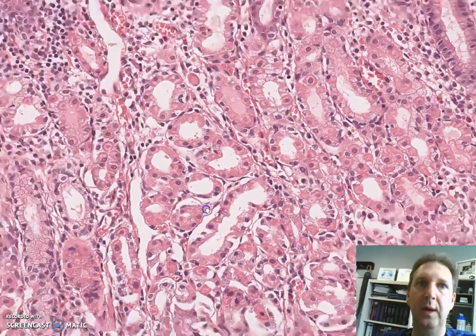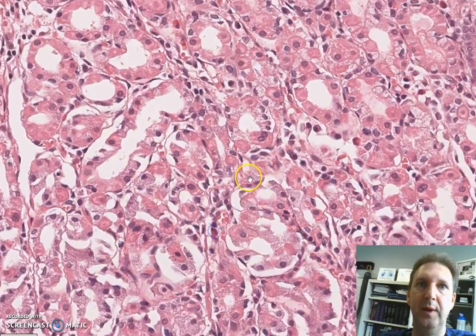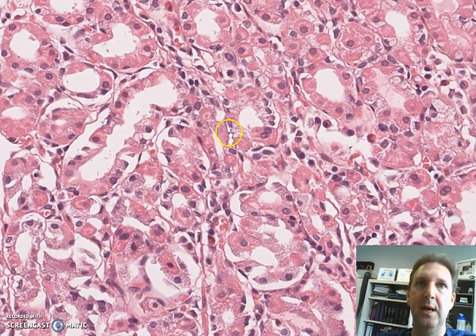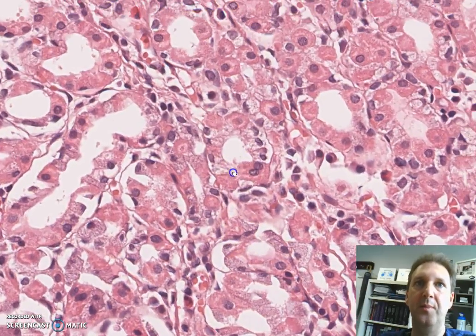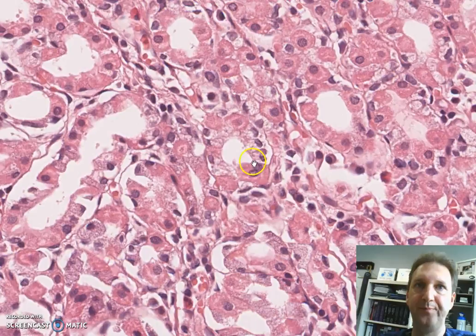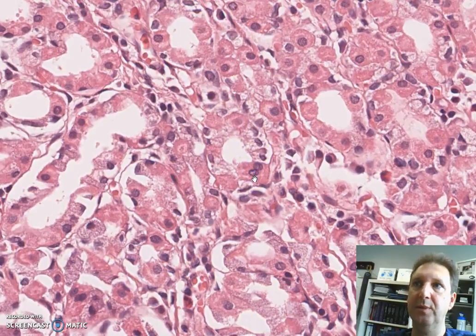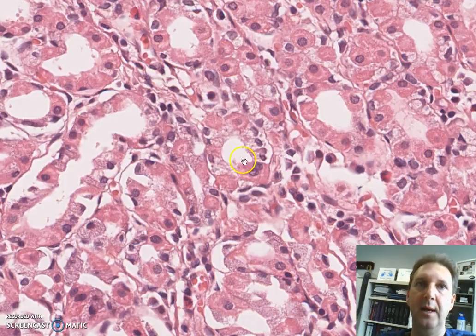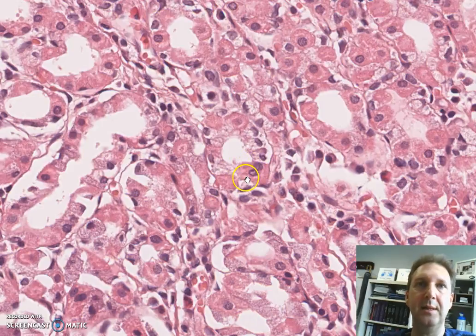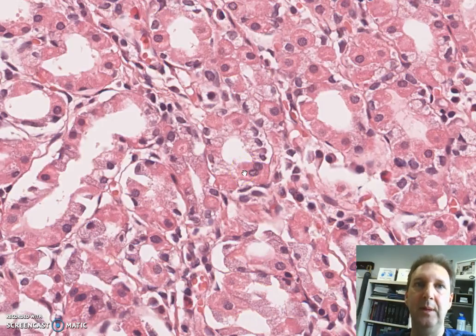If we go slightly deeper into the tissue, we can see the crypts that are composed of two cell types: some pink cells and some blue cells. The pink cells correspond to the parietal or oxyntic cells. They have a high content of mitochondria and they secrete hydrochloric acid and intrinsic factor, which is used for vitamin B12 absorption.